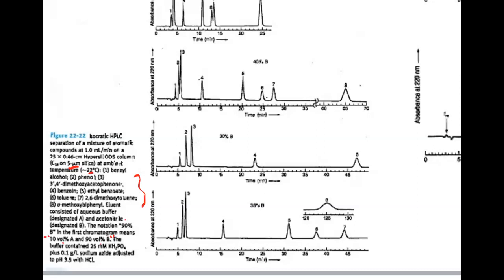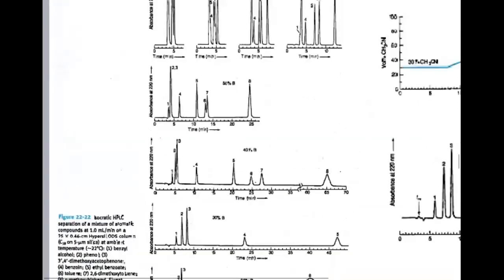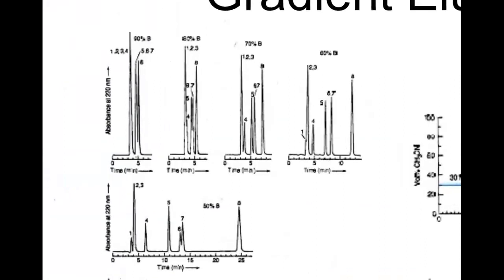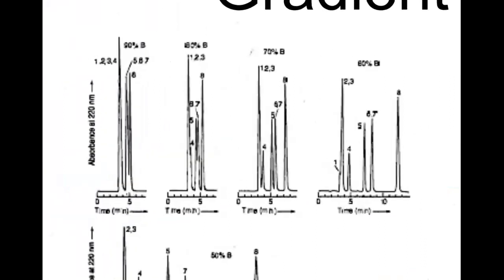And the buffer in the aqueous phase is a phosphate buffer, a certain concentration adjusted to pH 3.5. Okay, so all these different figures, and basically what they represent, let me zoom back in. What they represent is more or less the results. It's hard to see because it's not the greatest resolution, but the results for changing the percent B, if I remember correctly, was the acetonitrile in the experiment.